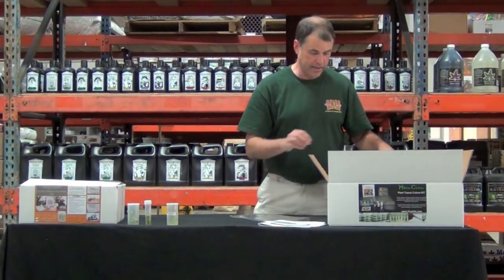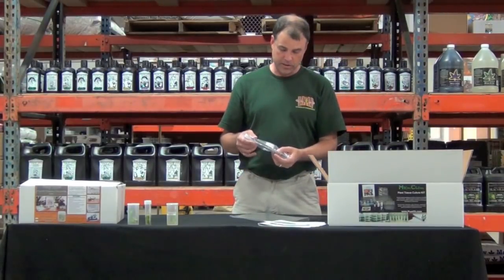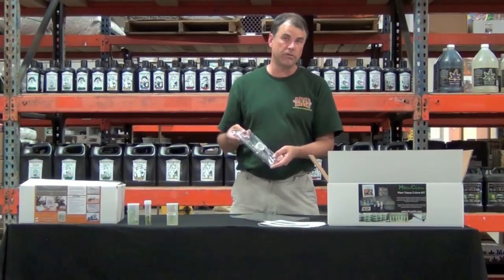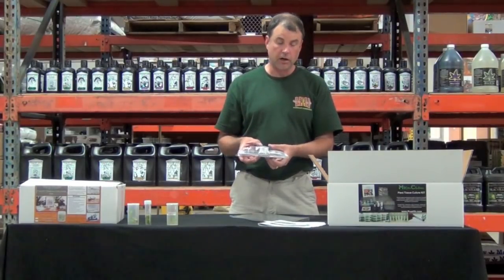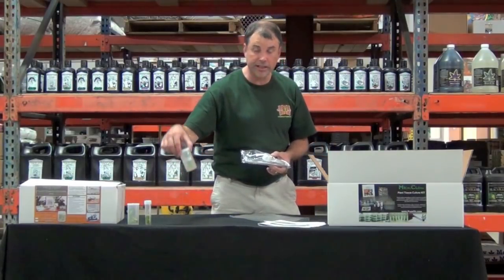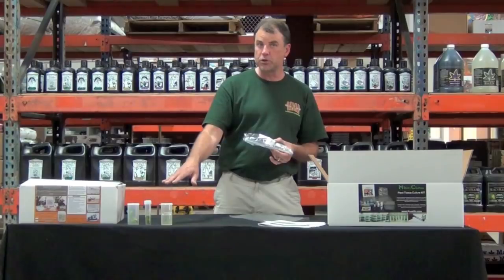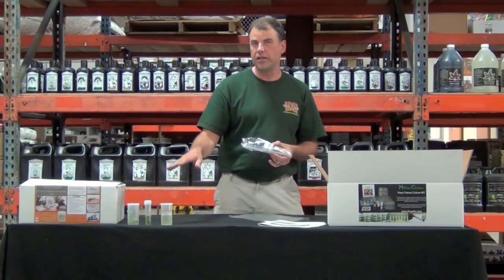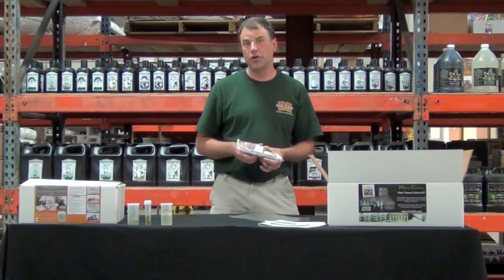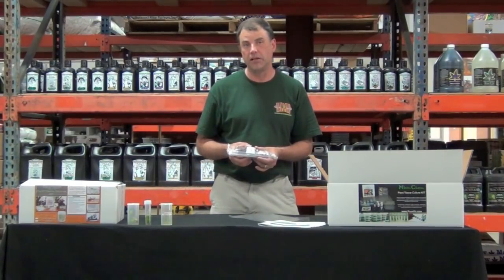Also in the kit you will get a tool kit. This has a pair of forceps, a stainless steel scalpel and two blades, and a roll of polypropylene tape which we use for sealing the bottles as an extra precaution. Not absolutely necessary, but when you get started it's best to use every precaution you can. It's also very handy if you were transporting vessels. All of these have been wrapped with the tape.